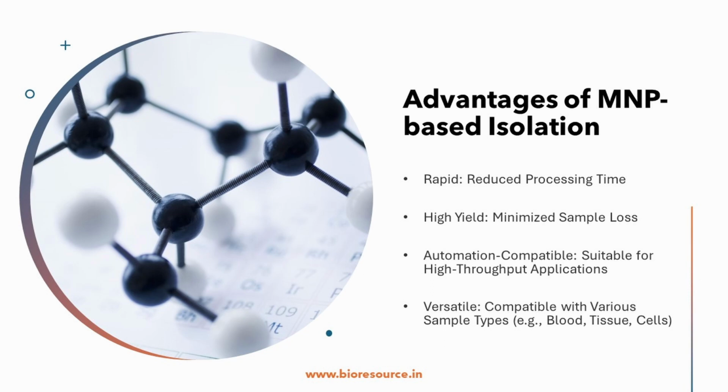The magnetic nanoparticle based extraction is very versatile, and it is compatible with various sample types like blood, cells, tissue, etc. The isolation protocols can be adapted to work with a wide range of sample types, and by adjusting the sample preparation step and optimizing the MNP surface chemistry, one can isolate nucleic acid from blood, tissue, cultured cells, and a number of sample types. We can use this method for isolating nucleic acid from different sample types, and this versatility makes the MNP isolation a valuable tool for various research areas.